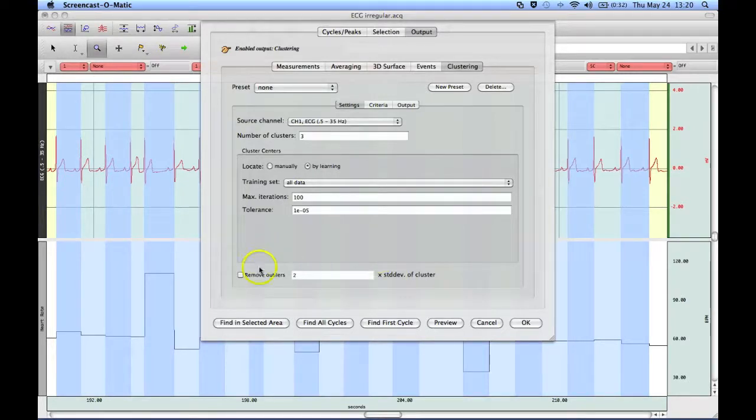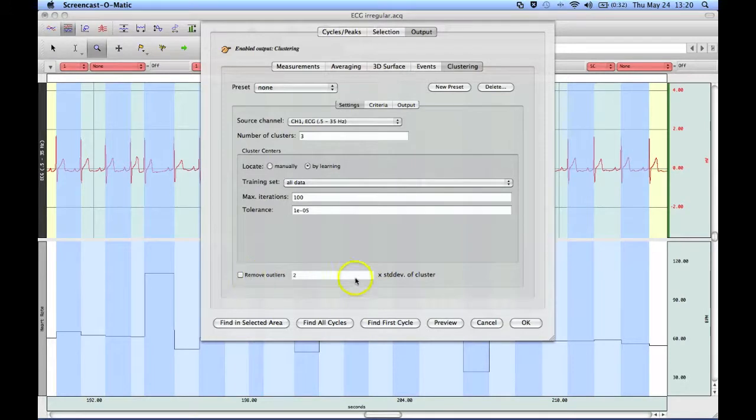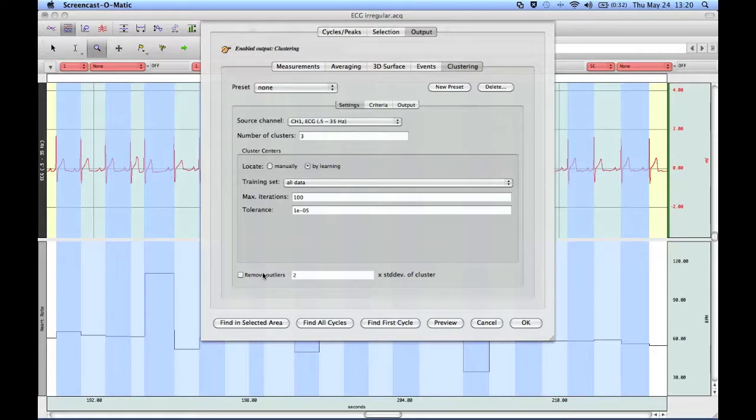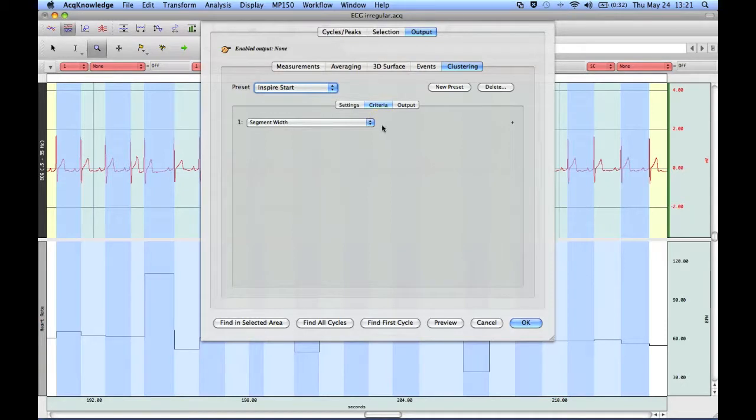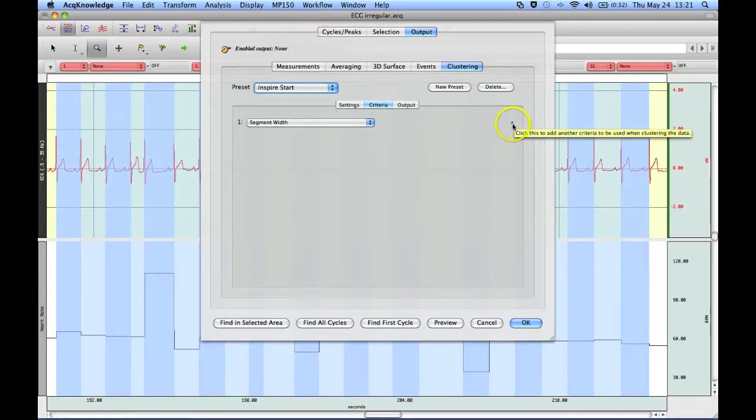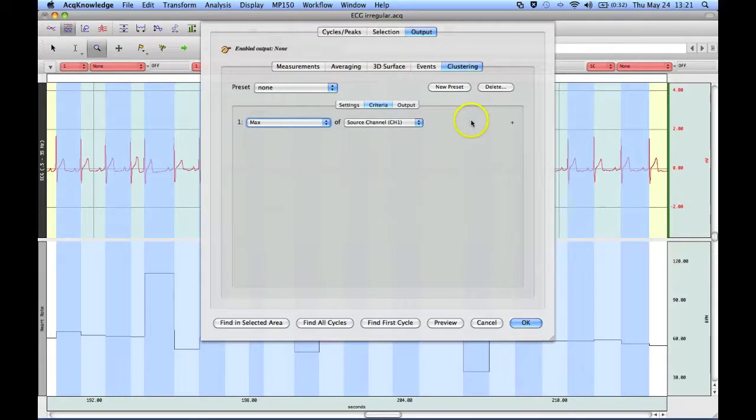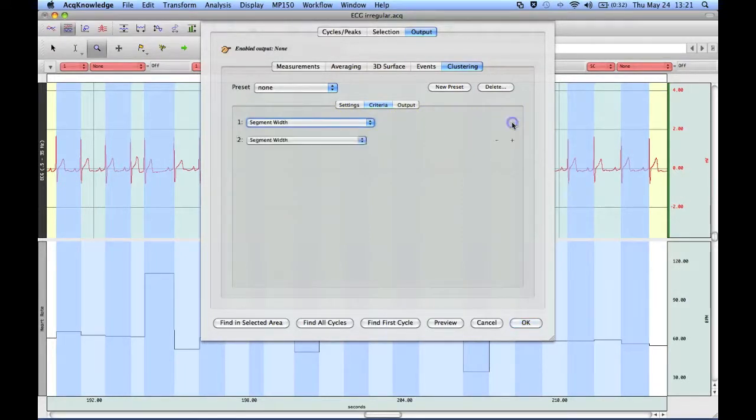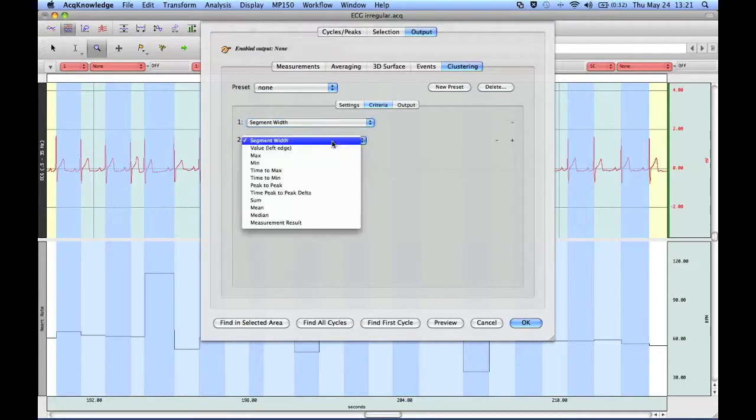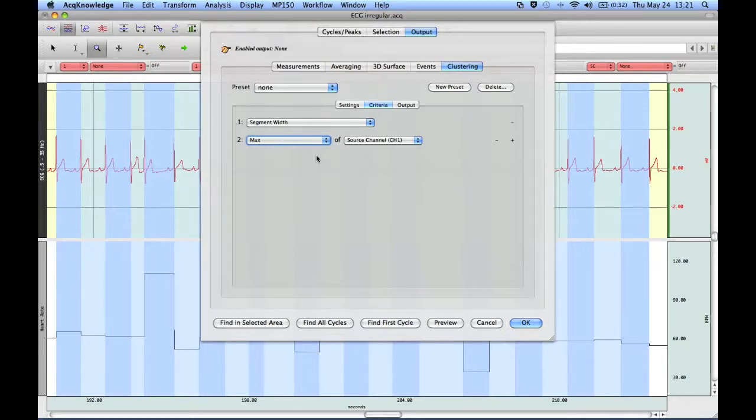It is possible to remove any outliers, but for this particular set of data, I actually want to include everything. But if you check the option here, you can then set the criteria for removing any flyers that exist within the data. If we come over to our tabs, the first thing you have to do is set the criteria, and I'm going to use two criteria for this. The first one is going to be the segment width, and the segment width in this case is going to be the R to R interval, and then I'm going to add the R wave amplitude. So I've got two criteria that the software is going to look for.